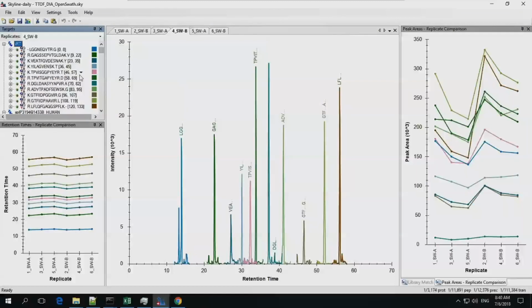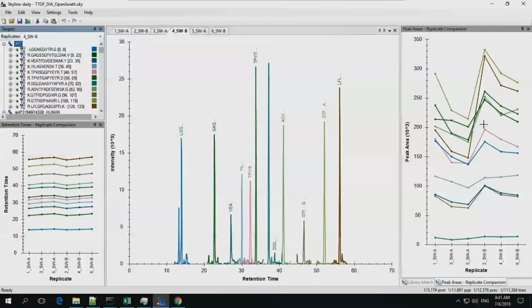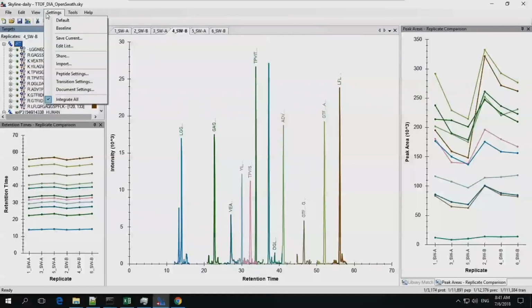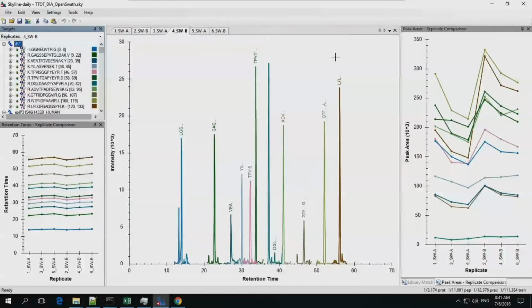So I would recommend spending more time looking at the data. Just this morning I was thinking the course might better be split so that we run everything in OpenSWATH, then we look at everything in Skyline, and then we run statistics, which is more how I would recommend you do things. Because if you just follow the progression that the tutorial did, it's sort of like Skyline's this other thing you can do, and then you do exactly what I think is really dangerous, which is you run your OpenSWATH on the command line and then go straight to statistics. So I think you should be spending some time understanding effects and looking at your data, looking at your CVs, even at just the basic level. You're going to get bitten by things if you're not checking your mass errors and just looking at how the data looks.